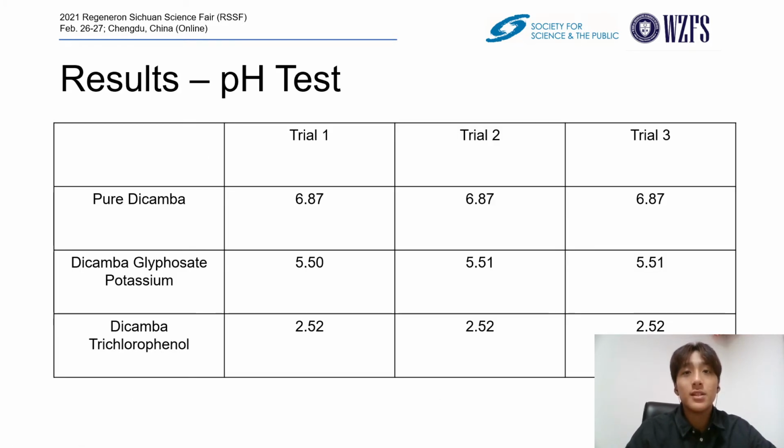The experiments were conducted using industrially preferred concentration, so the pH measured for such concentration was used as the control. The experiments were conducted recognizing that there could be possible effects on the volatility of dicamba solutions caused by concentration itself, regardless of pH. First, the pH of dicamba solutions at industrially preferred concentration was measured.